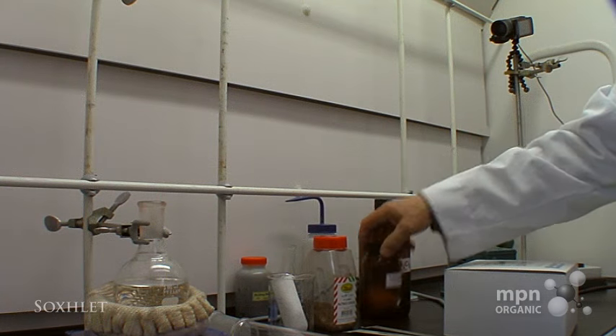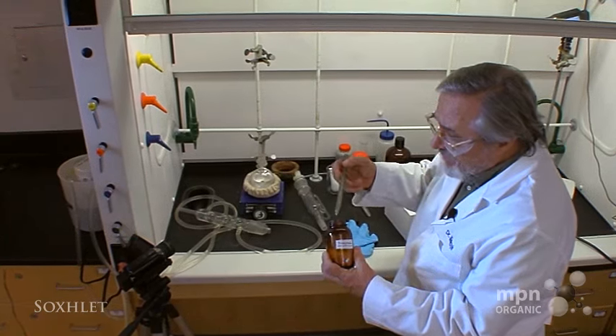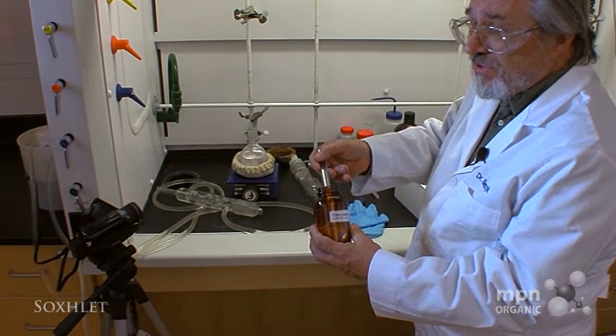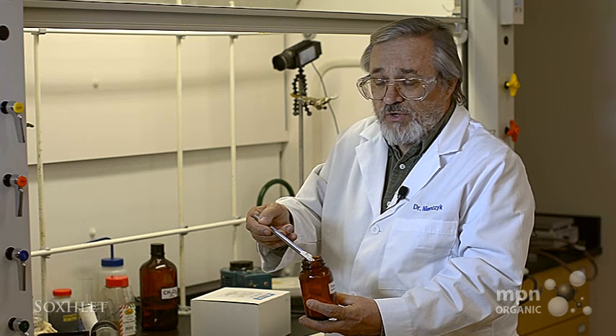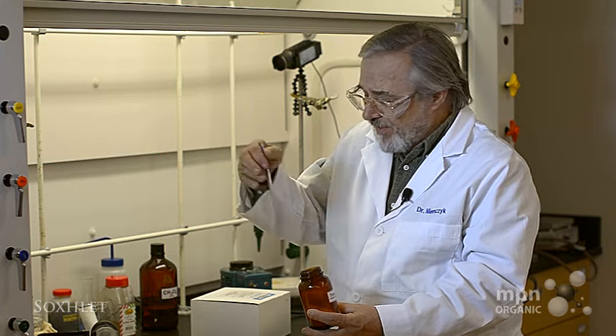What we get out of the nutmeg is a material called trimyristin. The ground nutmeg is a brownish color, but when trimyristin is purified, it purifies to a white solid. And this is what we're going to extract out of that nutmeg matrix.